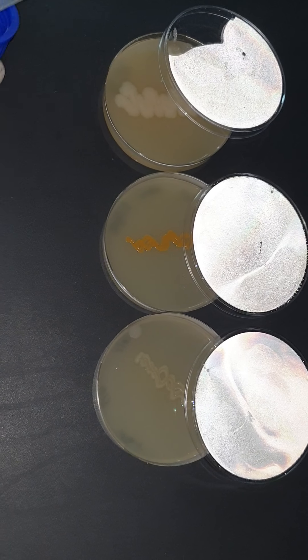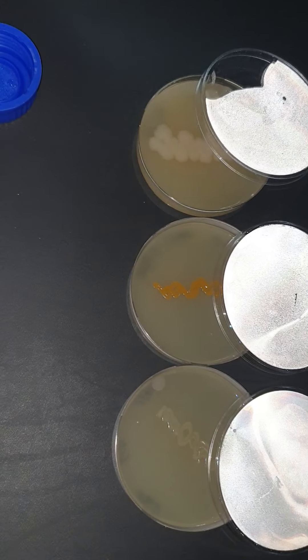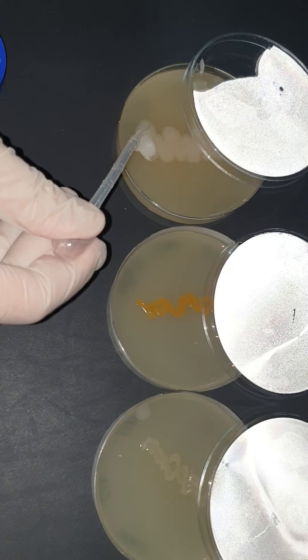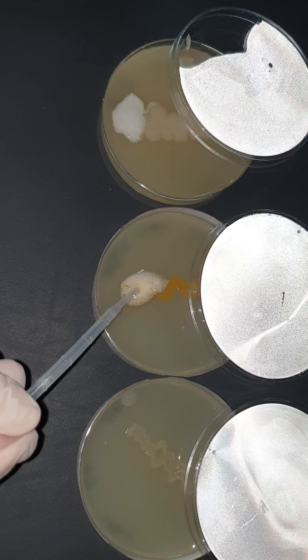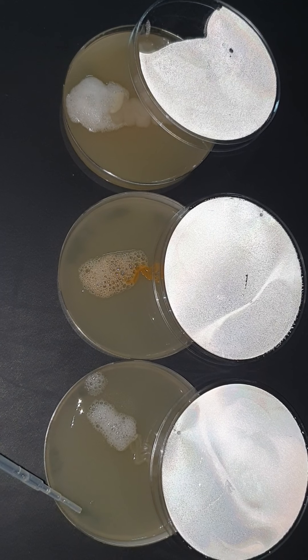Catalase test to detect if the bacteria is capable of undergoing aerobic respiration or not. I'm going to add directly onto the colonies a few drops of hydrogen peroxide. Just as a witness, this is one drop of hydrogen peroxide alone on that petri dish — it won't do anything, it won't bubble on its own.